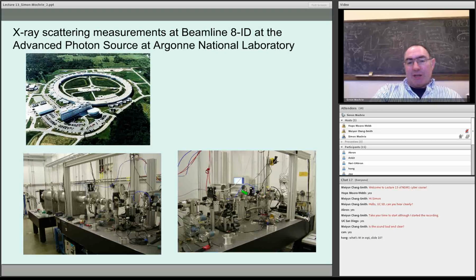There are certainly a number of slits here, and then the sample is here, and there are some slits in front of the sample that define the illuminated area of the sample, and therefore define the coherence, the lengths that you're looking at, L and M.